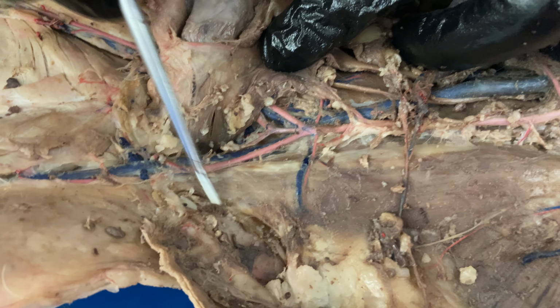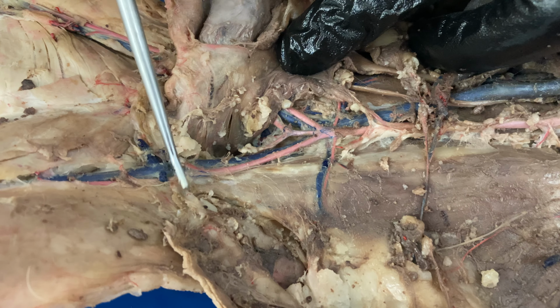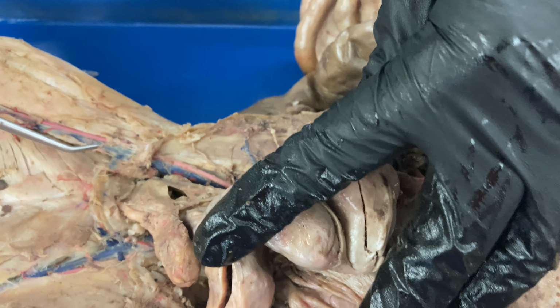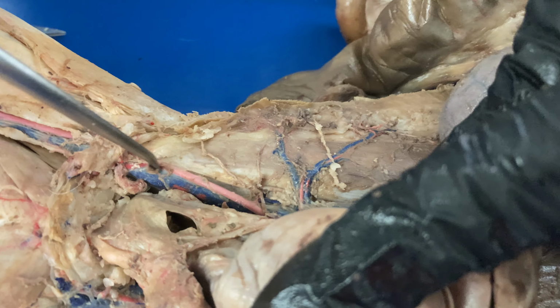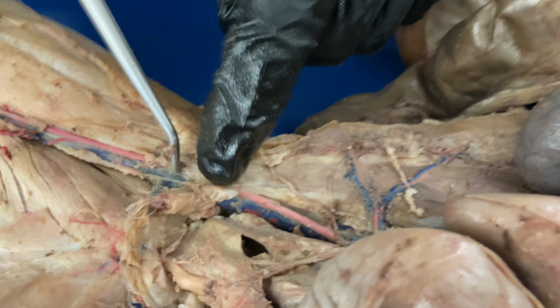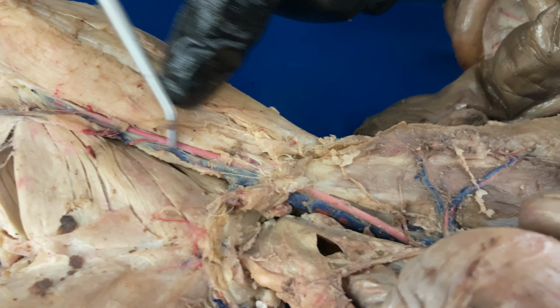You see how we convert from the abdominal cavity into the leg? This is where the inguinal canal would be. I'm going to show you on the other side. I've left the inguinal canal intact. And so you can see that the iliac artery and vein work through the inguinal canal, and then they convert into the femoral artery and vein.